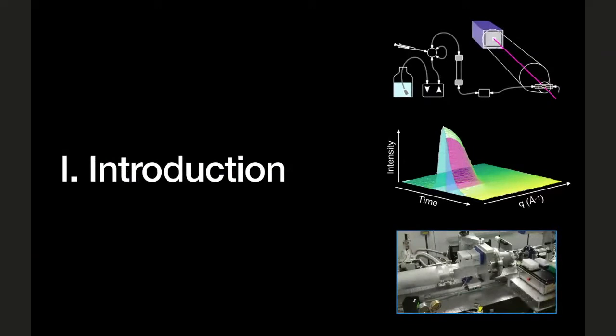So this talk will be mainly to introduce the SEC-SAXS technique to you. I'll try and teach you how to analyze data, and also at the end I'll give you some examples of more advanced things you can do with chromatography coupled SAXS and sort of what's on the horizon there, because this is a sort of rapidly developing technique.